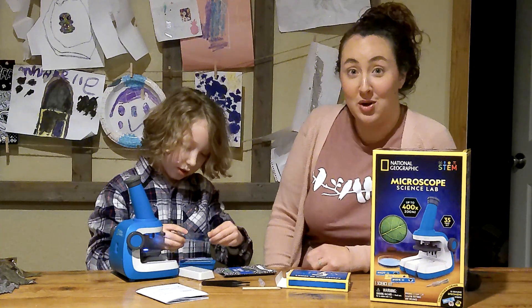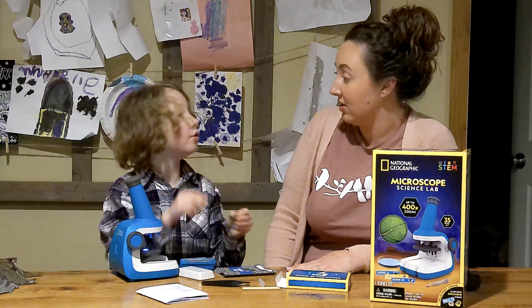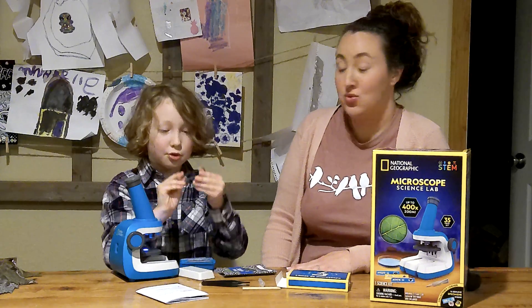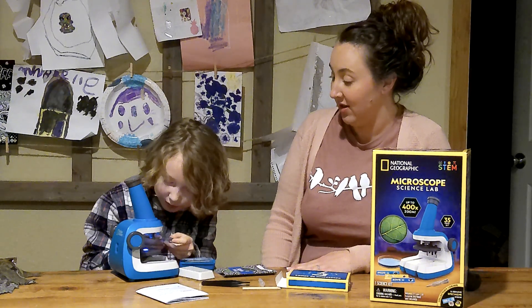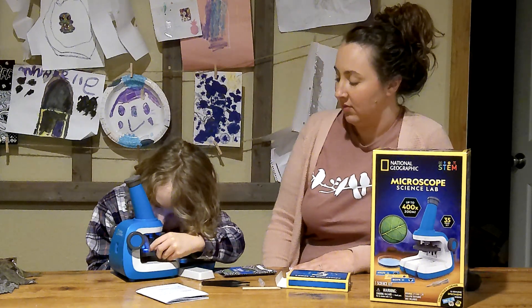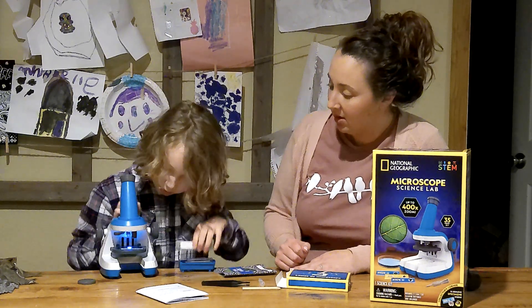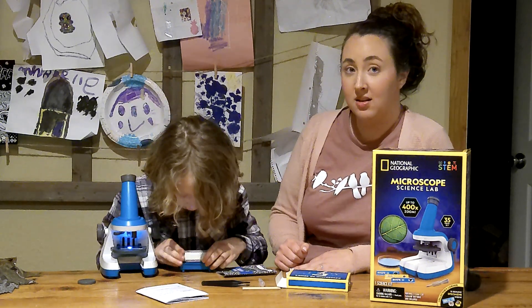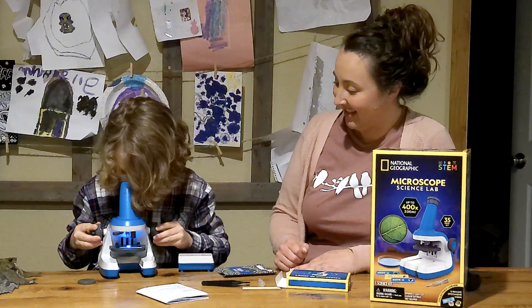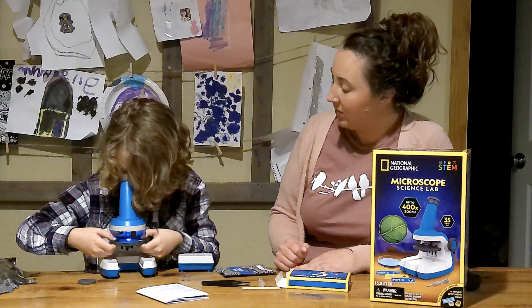We've got one more thing to show you. We brought the slides, but we were going to do only one today, and that is the onion one. Oh, neat. Is it onion skin? Yes, under the 40. Let me see some cells!